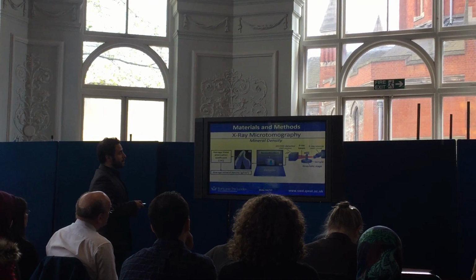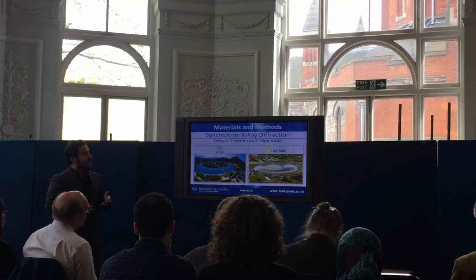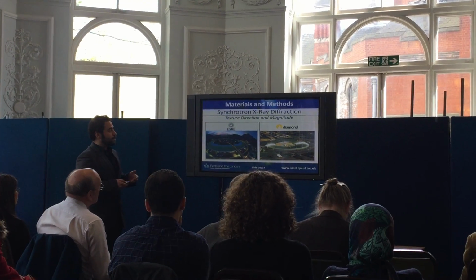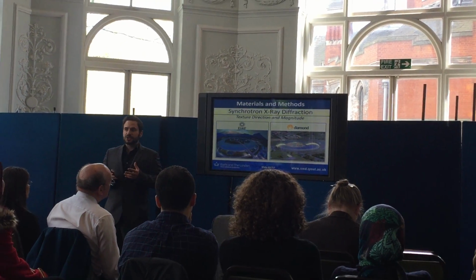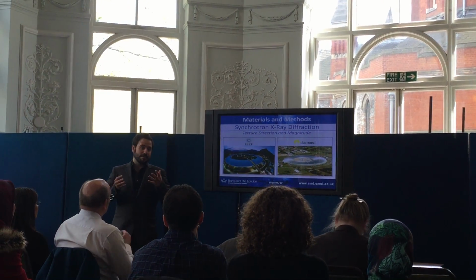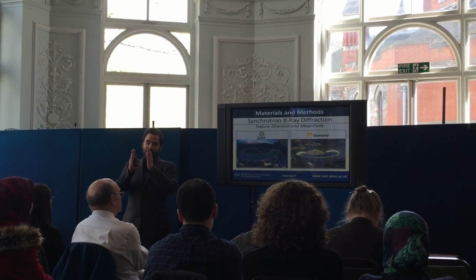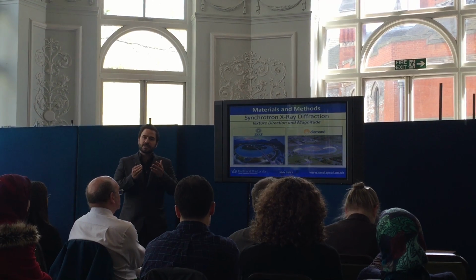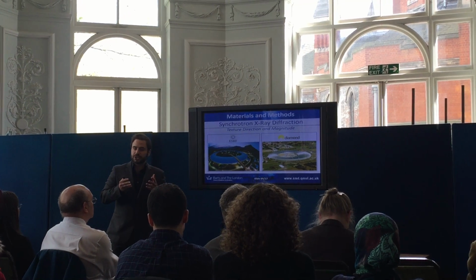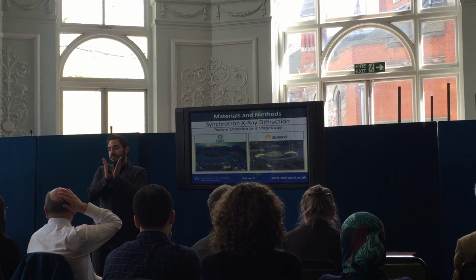The next technique I use is synchrotron X-ray diffraction. I use it to get texture, direction, and magnitude of crystallites. Before I move on, I would like to explain what I mean by texture. Every single material has building blocks. When these building blocks have, let's say, a preferred orientation, we call this material textured. Now, the magnitude of texture is a measurement of how aligned or how divergent these building blocks are.